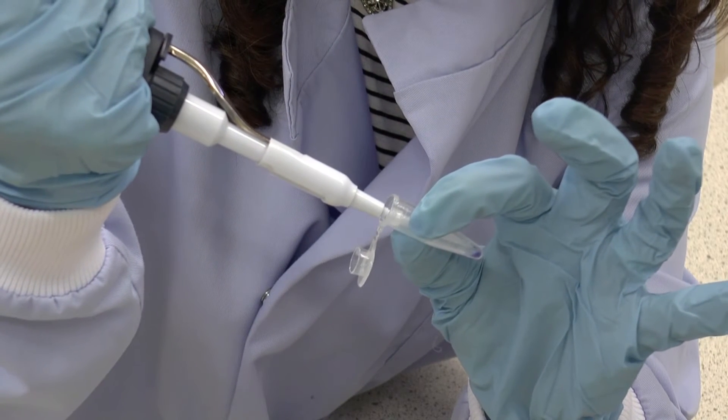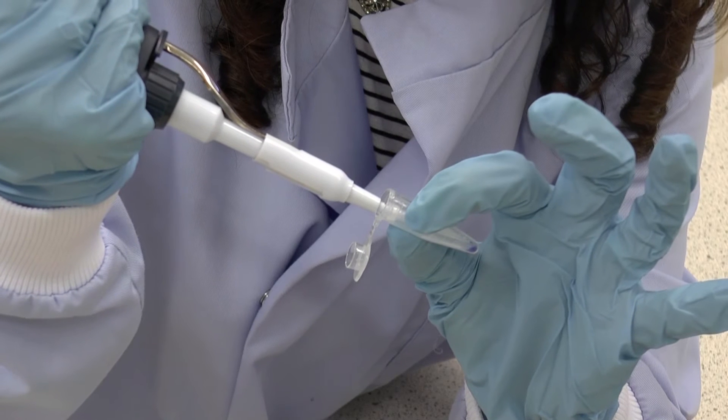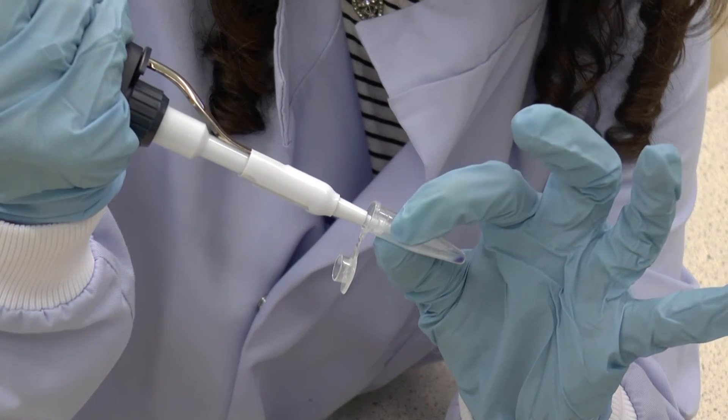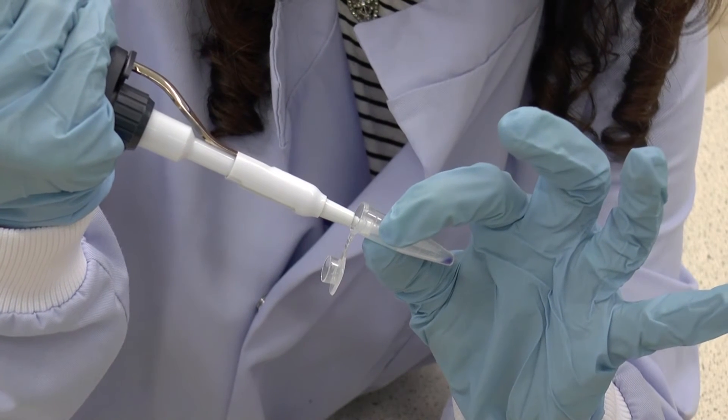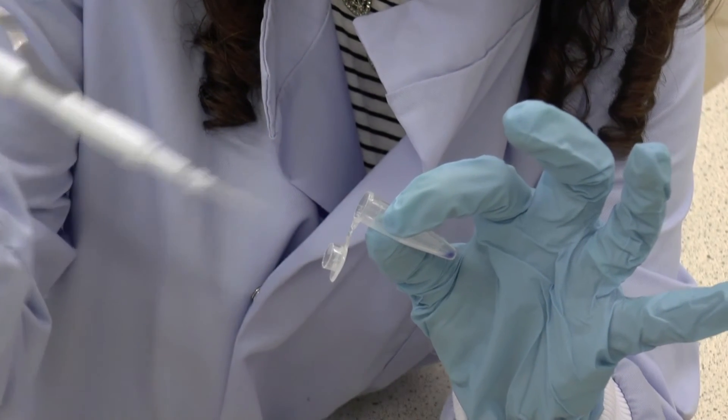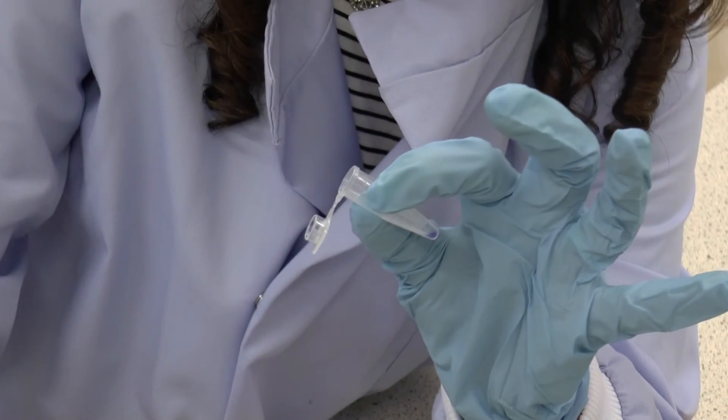Now what you can see is that there's still some of the enzyme left in the tip of my pipette. So I want to pipette up and down a couple of times very carefully and then eject so that all of my enzyme has gone into the solution.